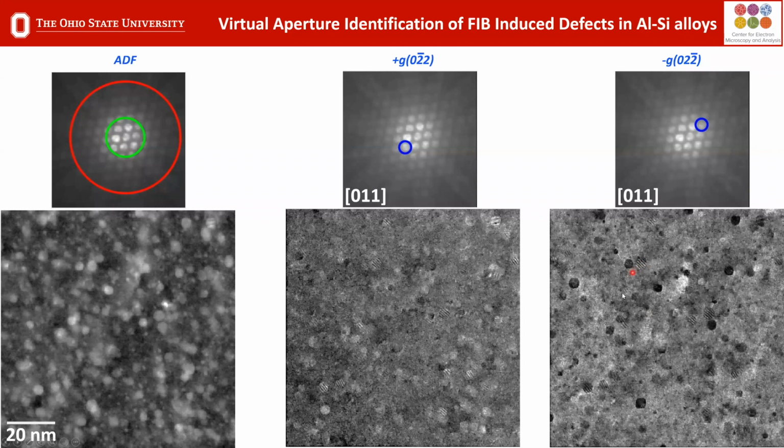We can see the circular dislocation loops. And without explaining why, just so you know, these aren't second phase precipitates. These are all ion damage dislocation loops or dislocation structures that were formed during the FIB processing. So if you don't know what you're looking at and you go in the microscope and want to show your advisor that you have beautiful second phase precipitates, you're going to be wrong when you show them this HAADF image or this ADF image.